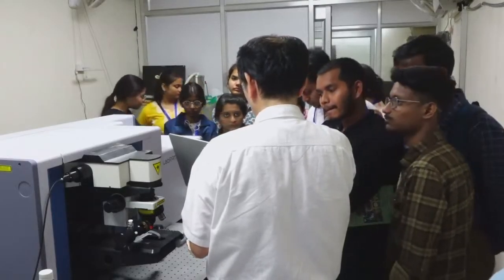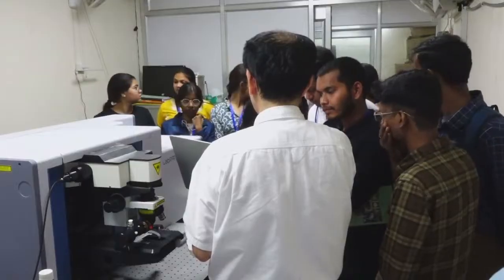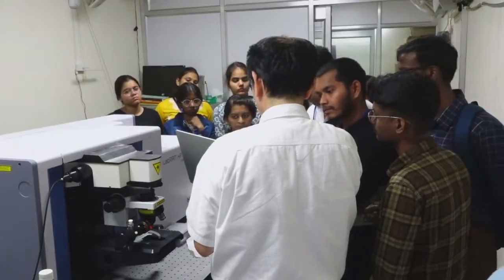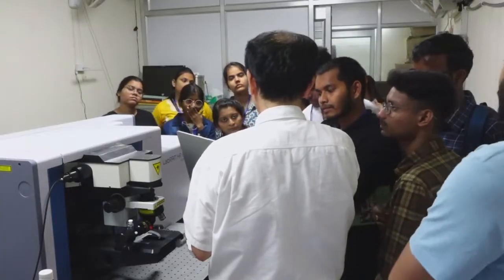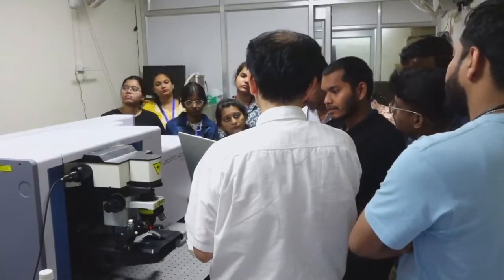So if the molecular structure is different, the vibrational mode is different, then the frequency becomes different. So the peak position is different. There are no two different compounds that give exactly the same peak intensity pattern. So it's unique. That's why we call it a fingerprint.